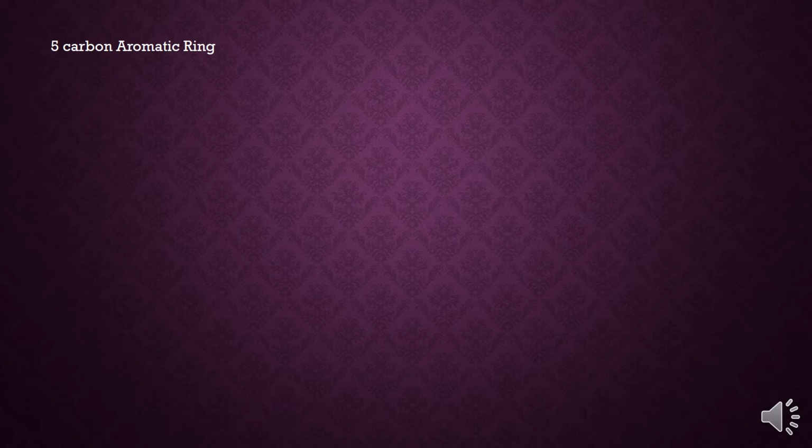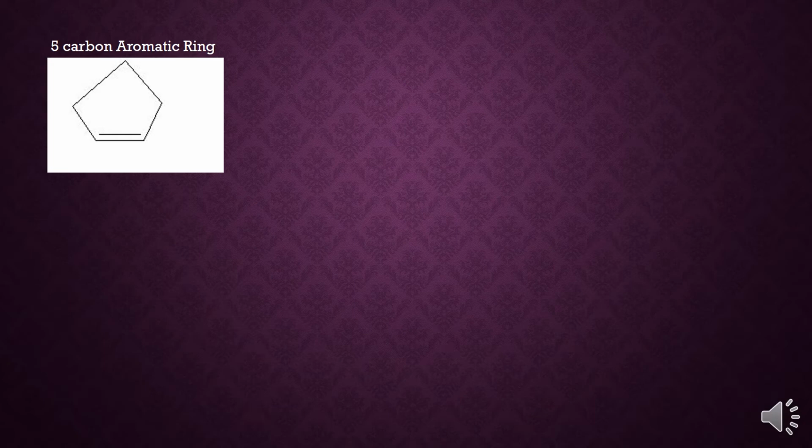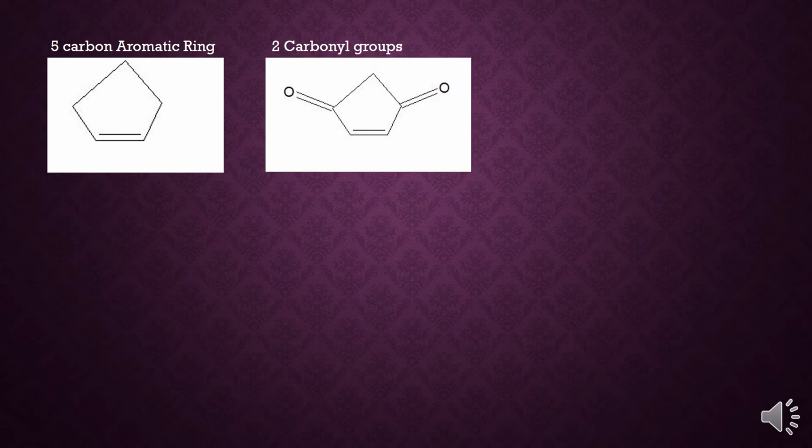We also know that we have 2 carbonyl groups, and since each of those requires a carbon, those are going to be bonded directly to our cyclopentene as shown. Now, we still have either a secondary amine or amide, as well as a methyl group to contend with. Here, it's going to depend mainly on the number of carbons and net hydrogens. We already have all 5 carbons used, but methyl needs an additional carbon to function. Therefore, we need to substitute a nitrogen, or our amide group, in for one of our carbons.